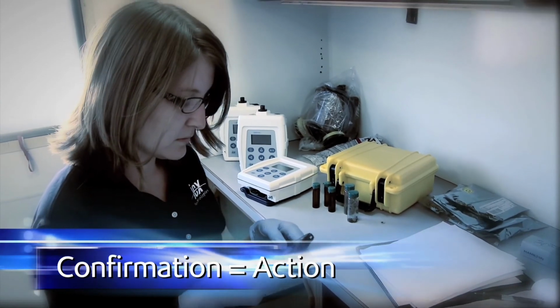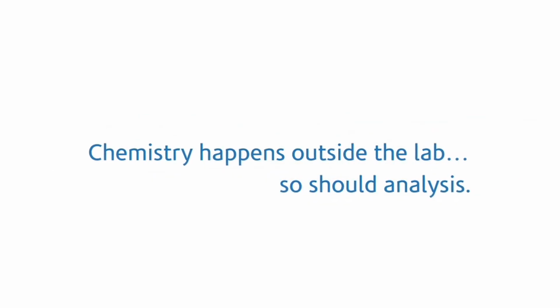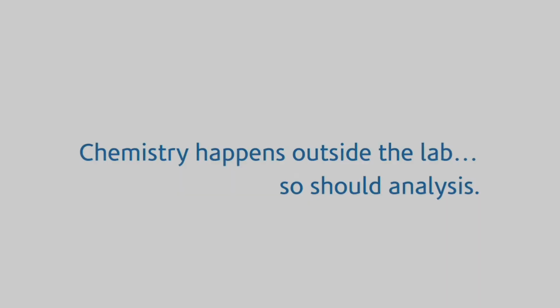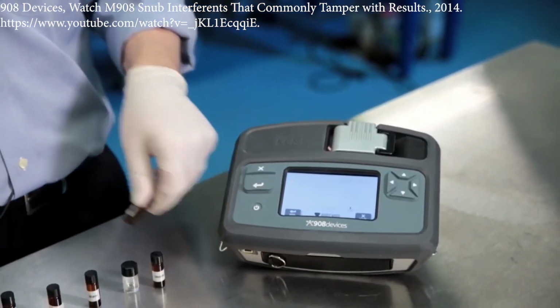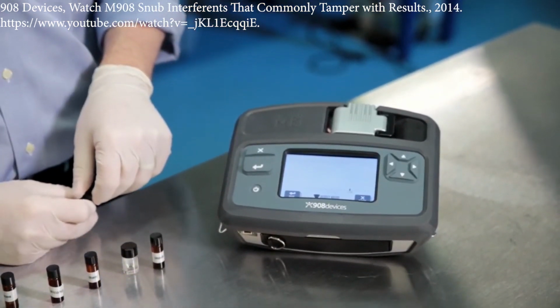Now, you can go through confirmation equals action. That means she's going to call somebody up for verification. But you can go through and pull the gas chromatograph and the mass spectra from the data for someone else to review. Another model of a fieldable ion trap is called the 908 devices.